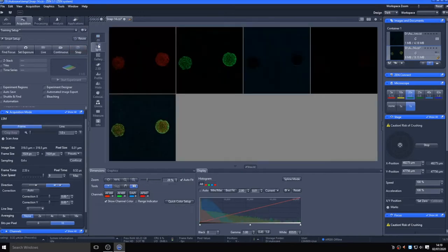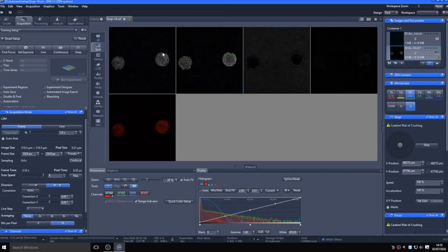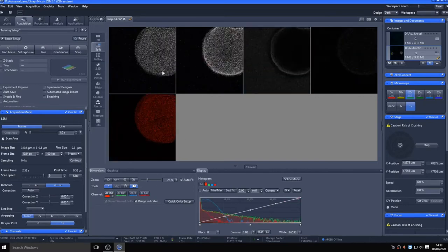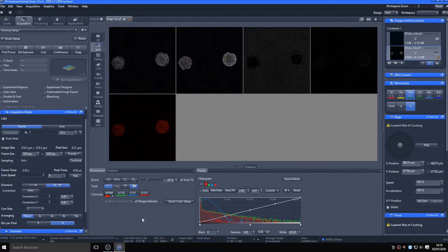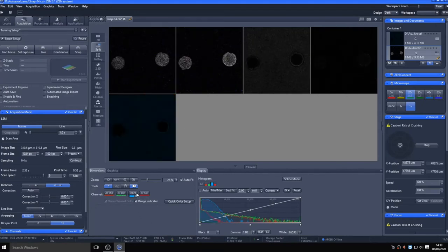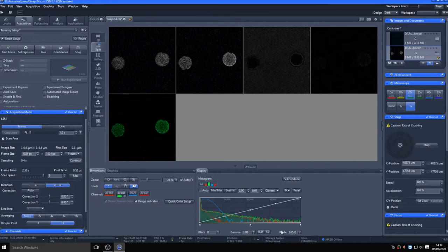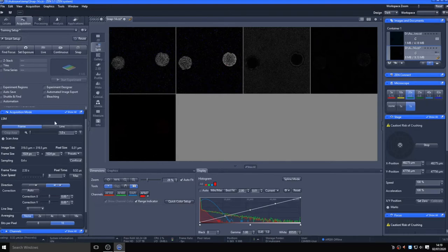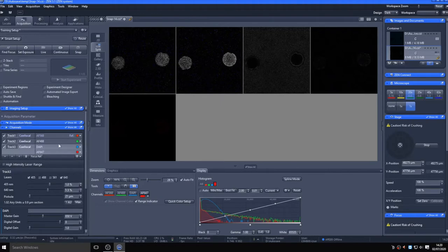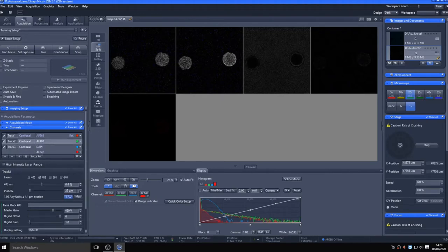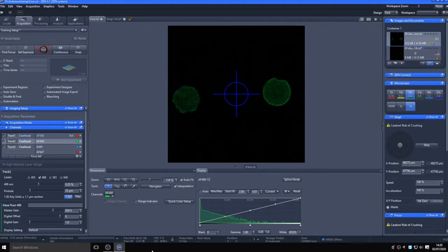So here, the 568 and 488 appear fine, maybe a little overexposed, with the 405 and 647 needing increased signal on this autofluorescent pollen sample. I'll adjust the laser powers and then run live again to check, using the histogram as my guide and going through each track one at a time. Remember to check through the focal plane to ensure correct exposure throughout the sample.